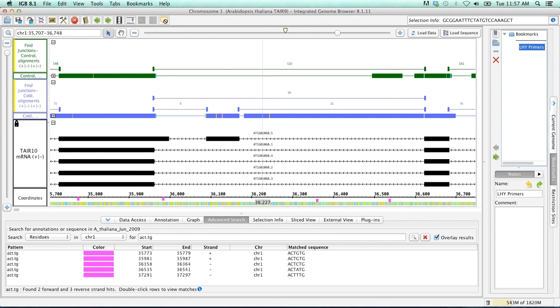So in conclusion, we were able to load our RNA-seq data into IGBE, check for alternative splicing for our genes of interest. We designed primers for this alternative splicing event using Primer3, and then we were able to visually check those using IGBE. So that concludes our focus on a feature for IGBE.